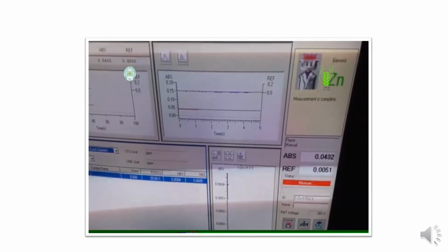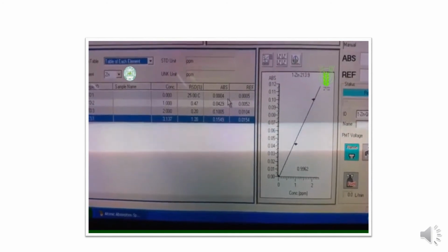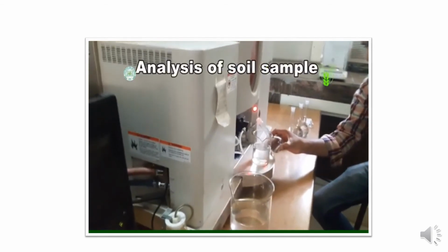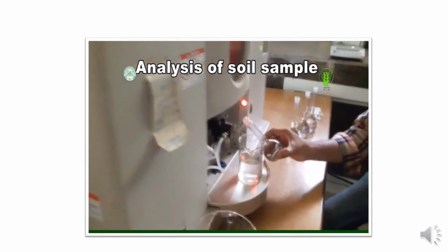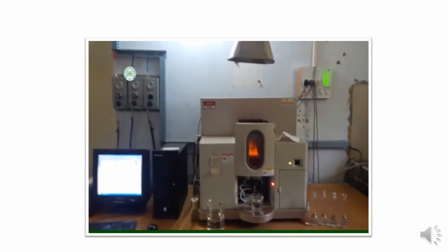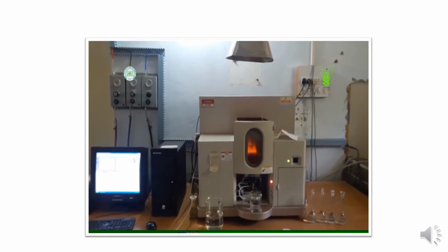Here in the video we can see the atomic absorption. We will prepare the standard curve by using all the series of standard solutions we prepared for each micronutrient. For zinc, we can see how we can measure the zinc. The atomic absorption will give the reading of absorption, because now we are running a series of standard solutions, and we are going to draw a calibration curve.